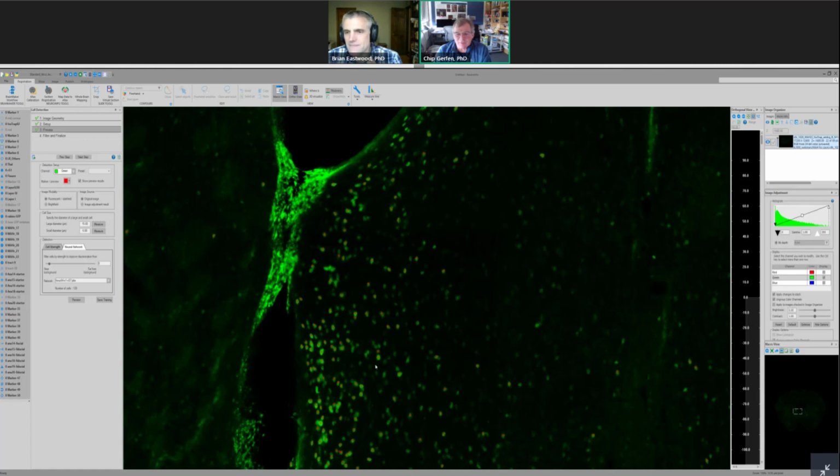So one thing is, depending on the parameters you set and run it through the whole brain, we could say it counted neurons with this set of parameters, and in these brains we often would detect 1 million neurons or something like that. And if we change these parameters at any point, particularly the threshold value, we could get 1.5 million, more if we decrease the threshold values.